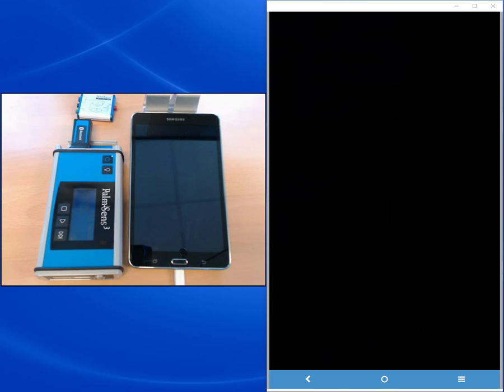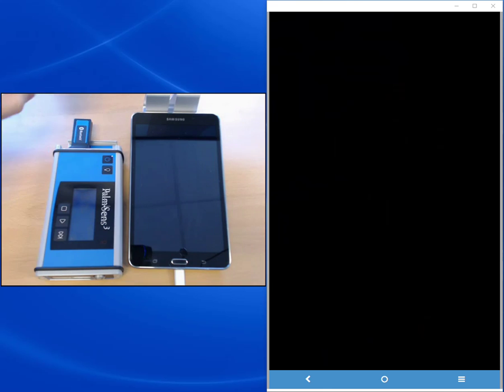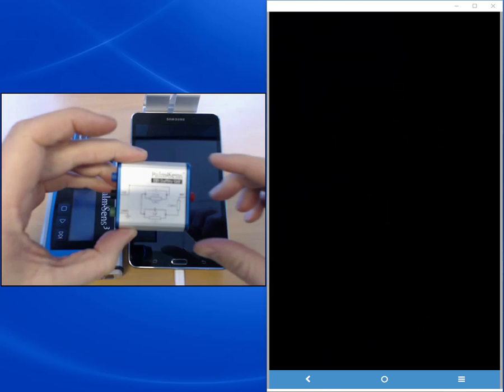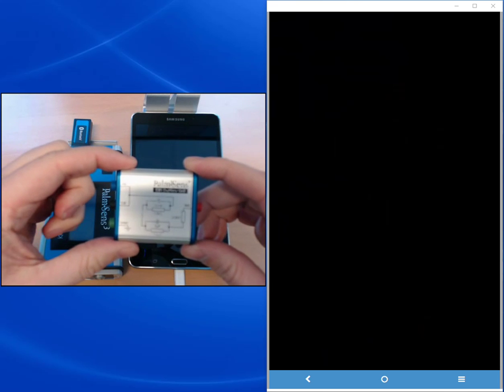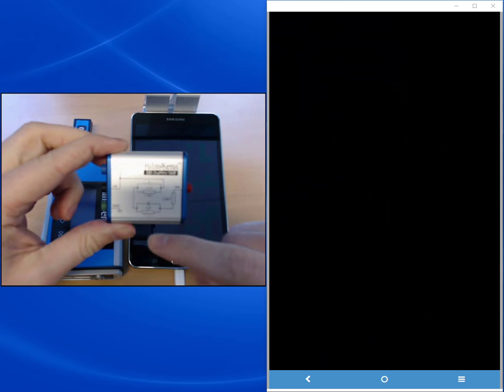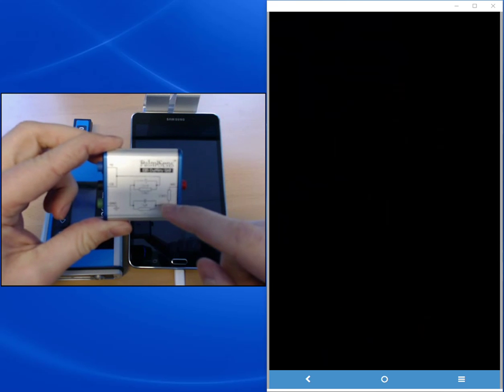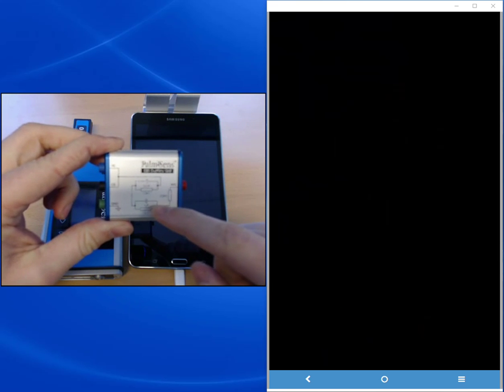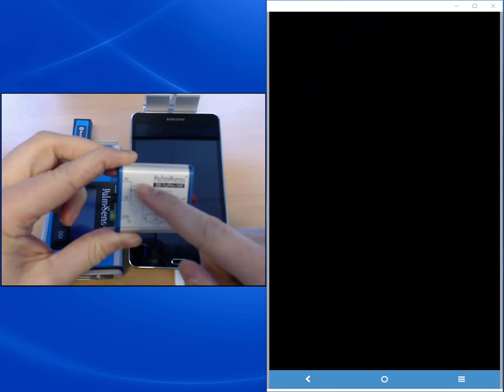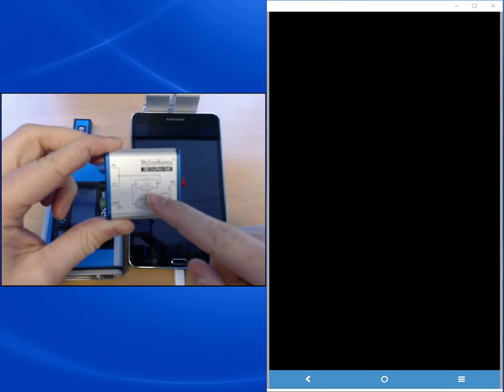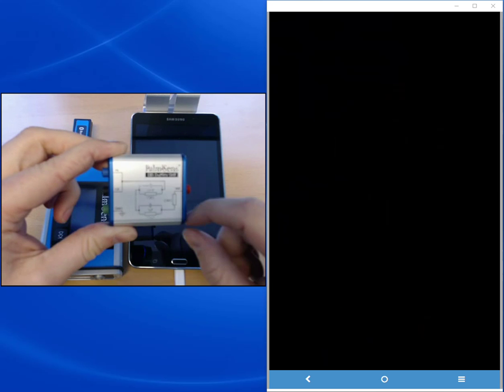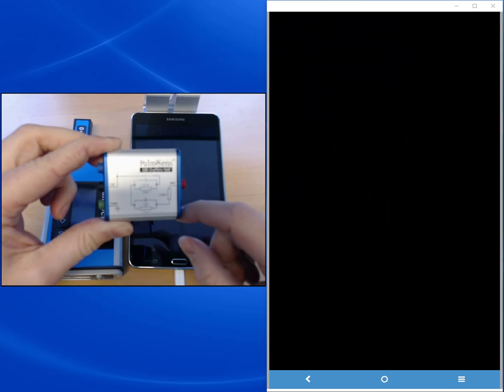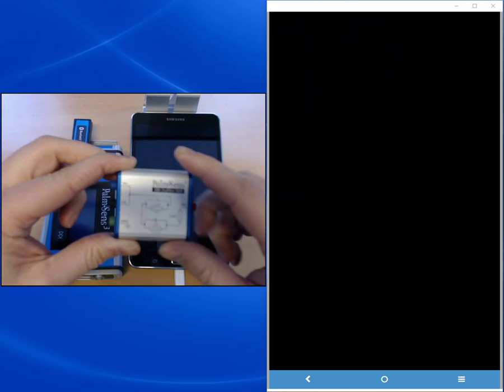Since I'm doing an impedance measurement, I've decided to use the impedance spectroscopy dummy cell by Palmsense. This dummy cell has as a circuit first a resistor serial to two RC systems. An RC system is made from a resistor and a capacitor in parallel, and this cell should give us a nice and interesting impedance spectrum.